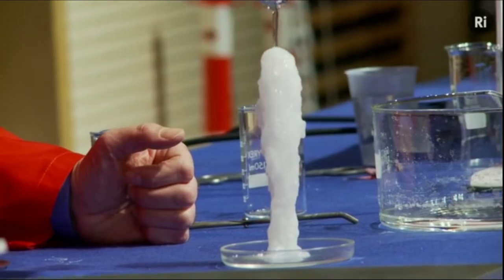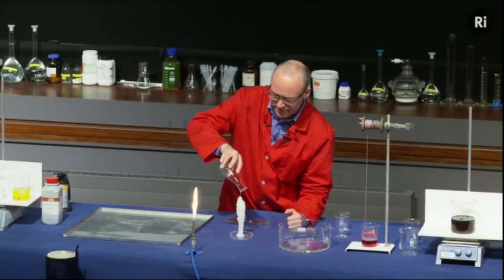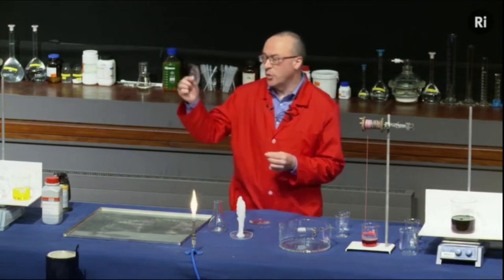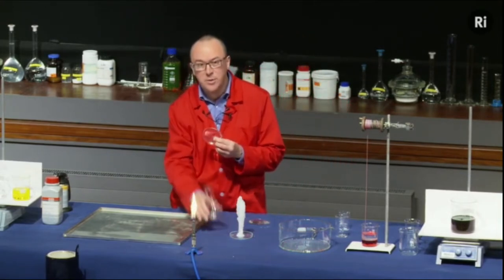Seems to be working. Okay, so that's a sort of sodium acetate sculpture. Now, oddly enough, this actually has a practical application, and this is the practical application. This is something called a hand warmer, and it's a plastic pouch, and it contains exactly the same liquid as in this flask.